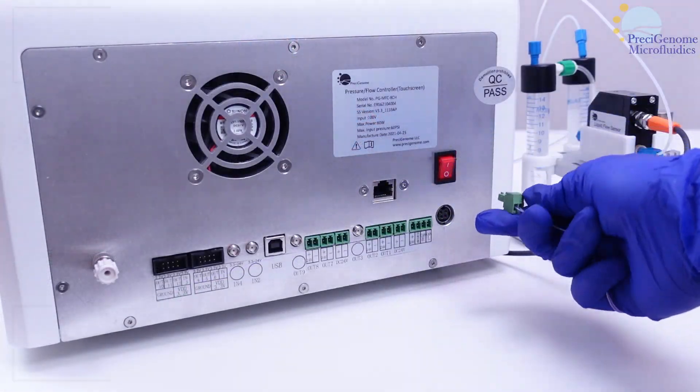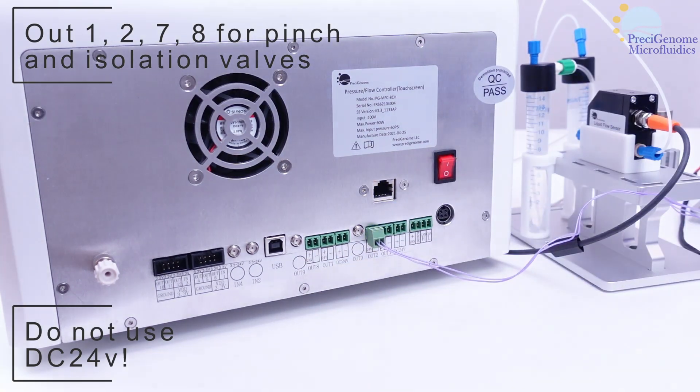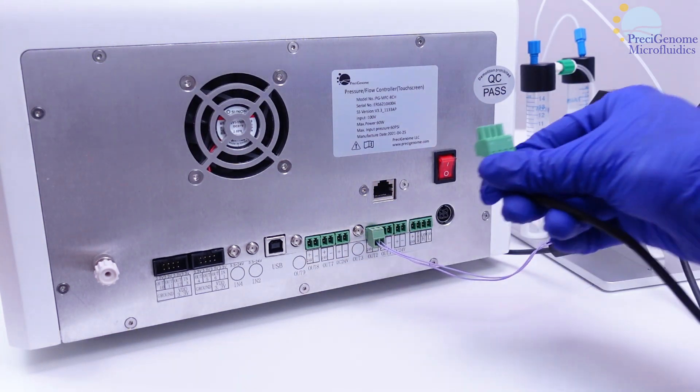Pinch and isolation valves can be plugged into outlets 1, 2, 7, or 8, but not the DC 24V ones.